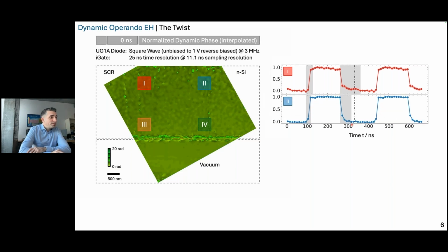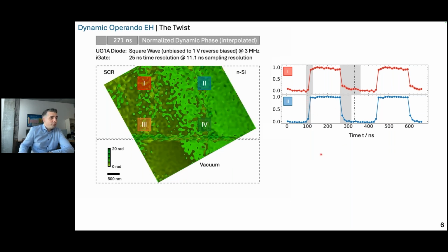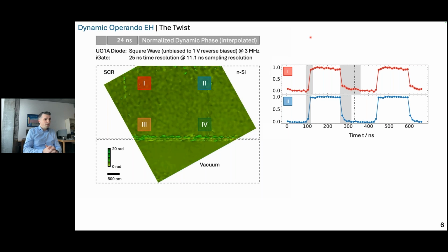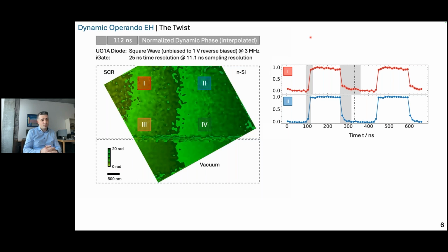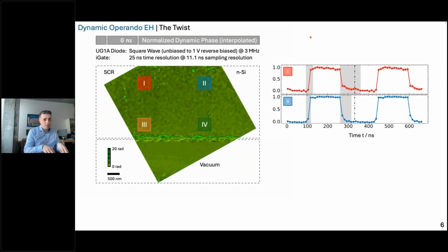But if we look at the second region, for instance, we see that already we have decreased the switching times, because in the N region, we expect the diode more to behave like a metal and not like a diode. So everything we can see here now is also explainable by theory, but in contrast to the oscilloscope, we can do now localized measurements. So we can track the progression of the projected electric potential during these switching processes in a localized manner. So we have basically an oscilloscope with very, very tiny nanometer probes that can probe nanostructures within these semiconductor materials.